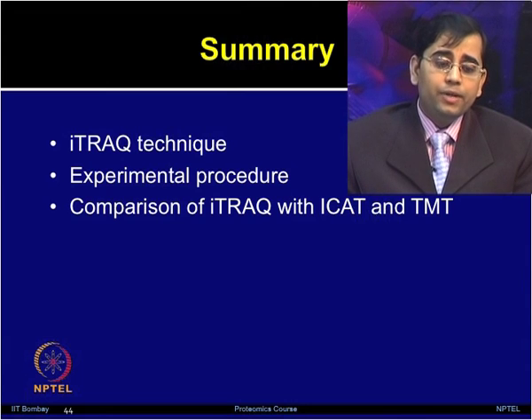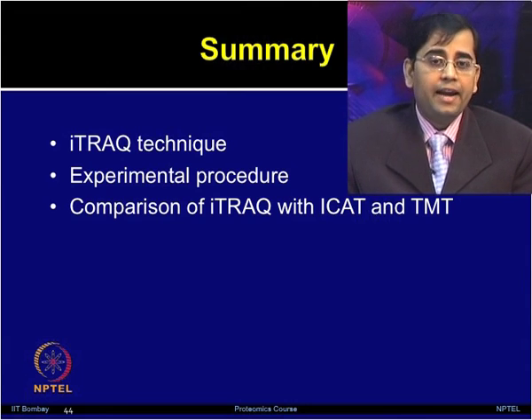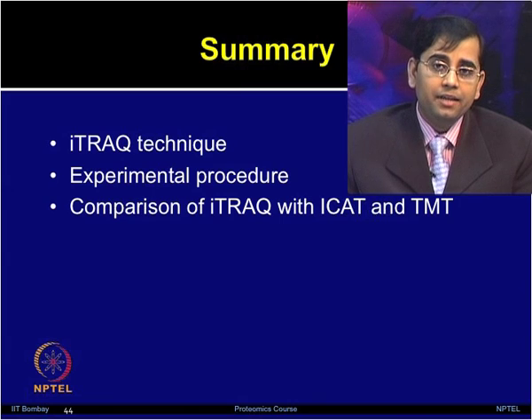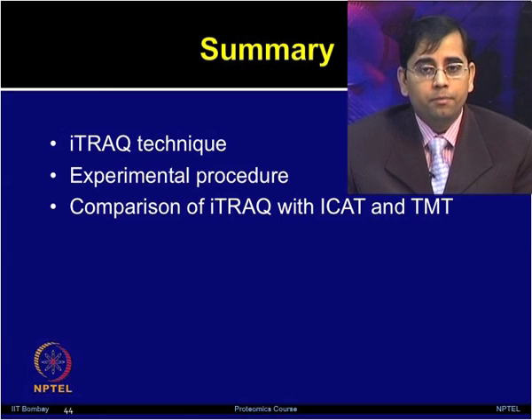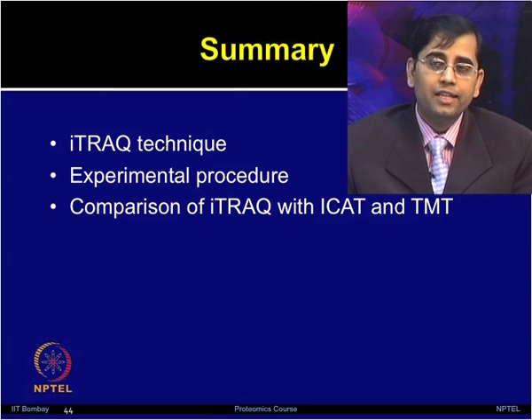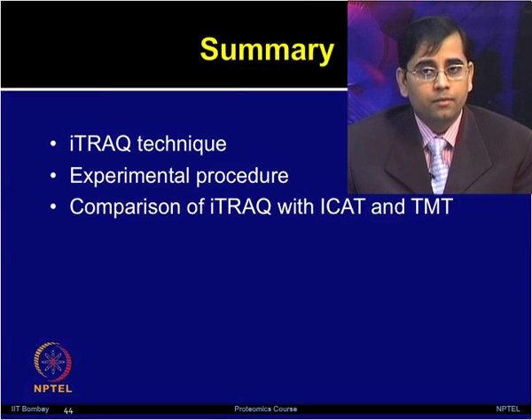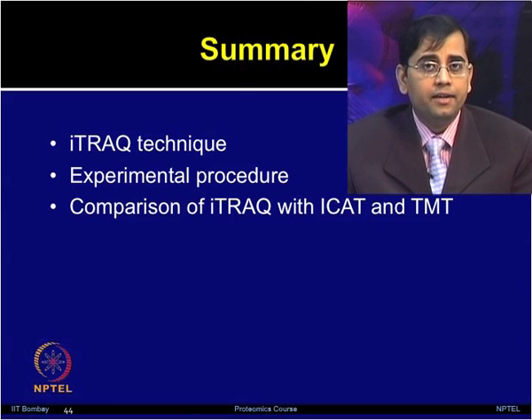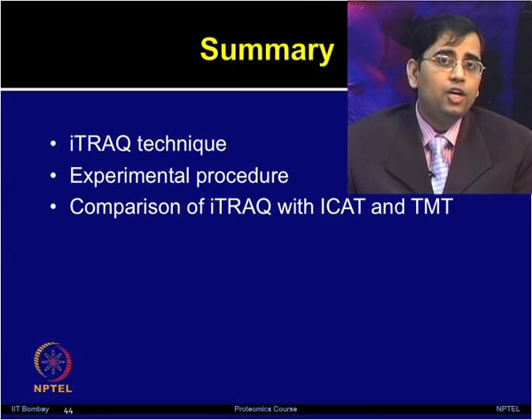So, overall in today's lecture we talked about the iTRAQ technique. We compared iTRAQ with ICAT and TMT, and during the discussion we also looked in much more detail at how to perform the iTRAQ experiment. As you know, with the steady advances in mass spectrometry, quantitative proteomics has progressed dramatically in the past few years. The efforts to analyze the proteome of many species, both qualitative and quantitative, have generated an abundance of data in a variety of biological samples, from bacteria to human.